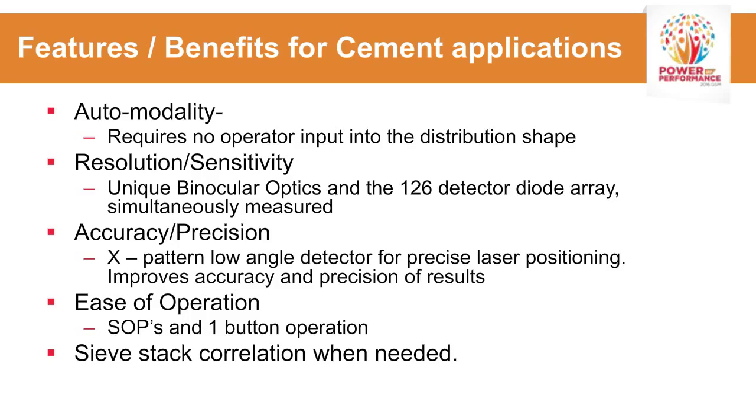Also available on the LS, for those that want to correlate back to screen sizes or mesh units, there's a sieve stack correlation you can use if you desire this capability. So we can individually correlate to individual screen sizes, and you would select the screens that you use, and you can correlate the results so the LS can give out the same type of correlation.